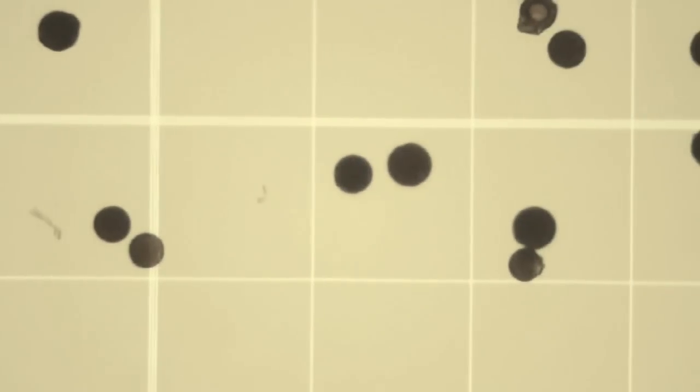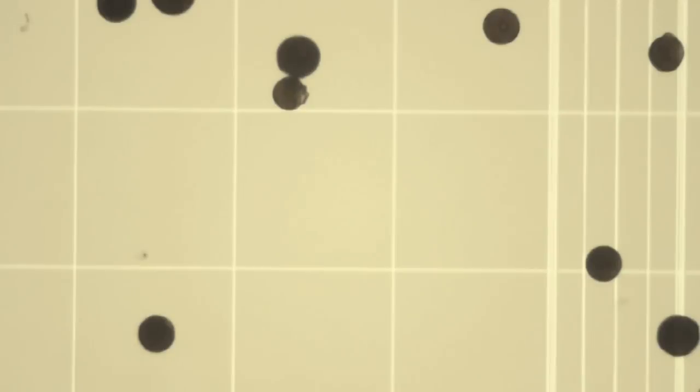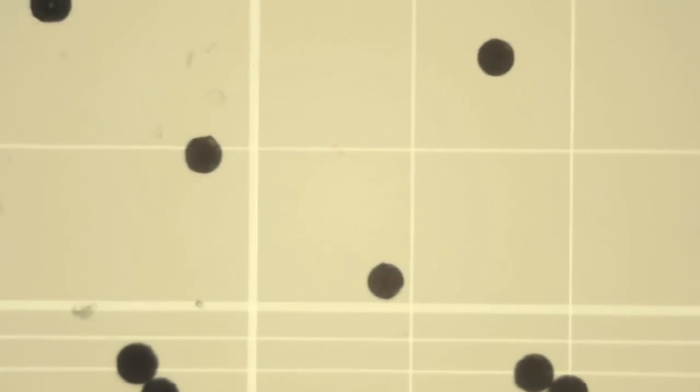So we would count 2, 4, 6, and now we're going to move the scope down. There's nothing at all in that row. There's 7, 8, 9, 10, and 11. Okay, so the upper left chamber has 11 particles. And I'd record that someplace, usually in the laboratory notebook or on the SOP.